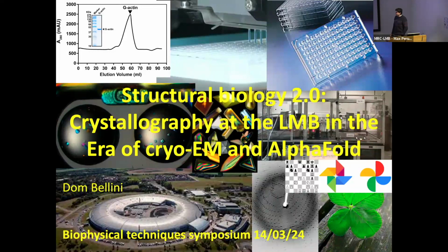I'm going to give you a talk about the X-ray crystallography facility today and try to give you some suggestions to help you decide whether you should use X-ray or maybe go to the EM facility or the NMR facility or just go with AlphaFold.